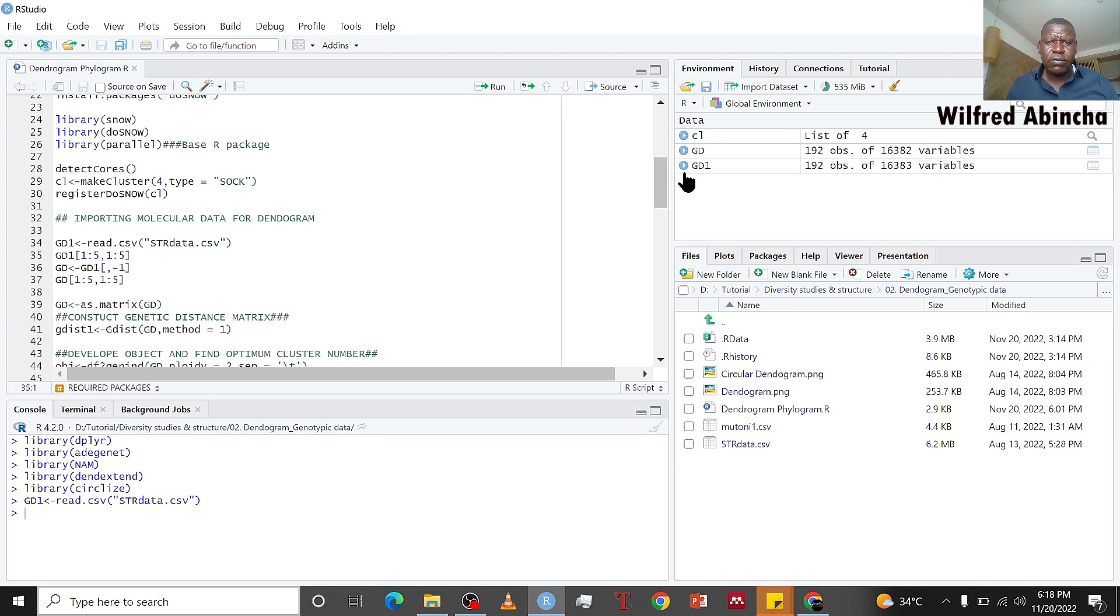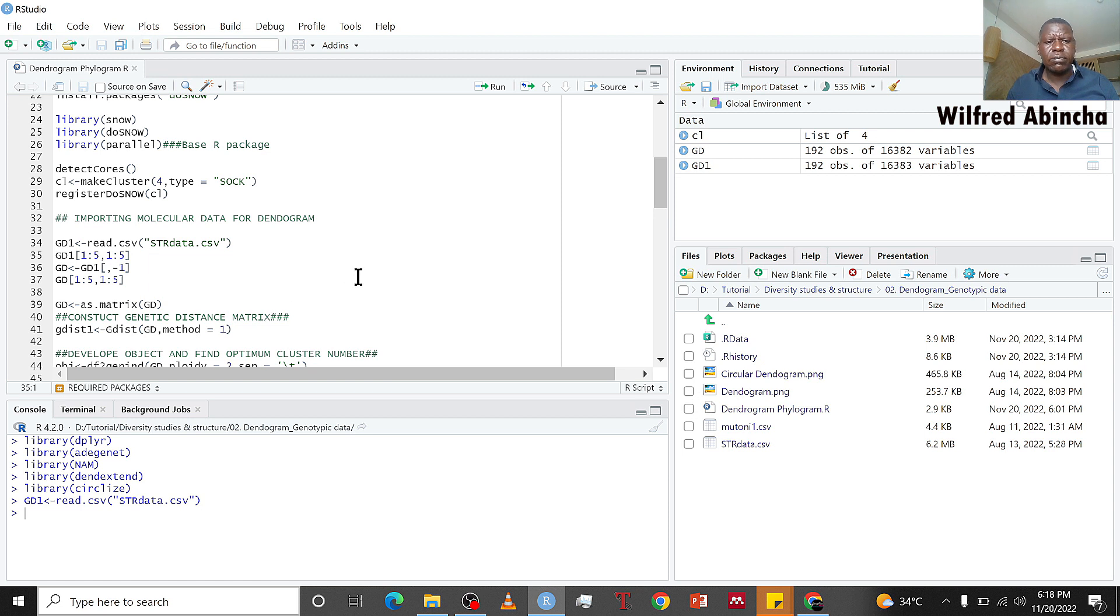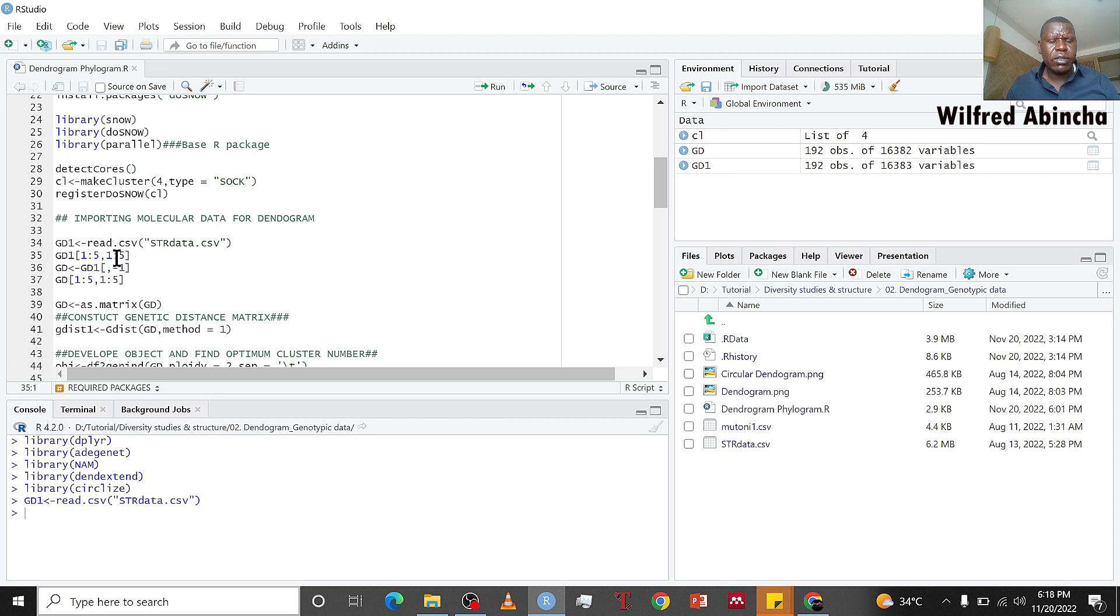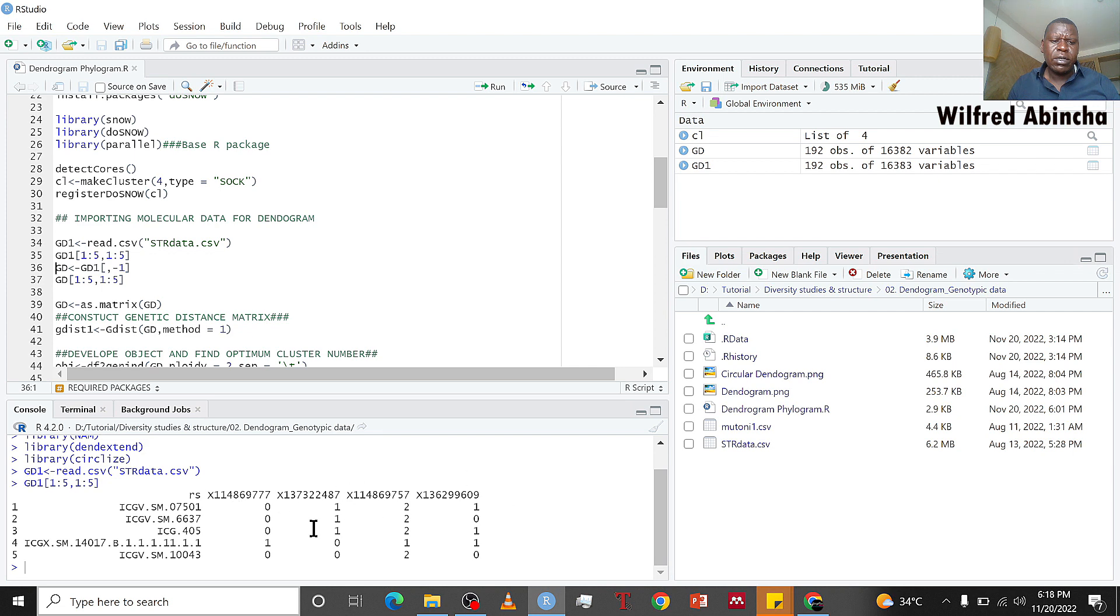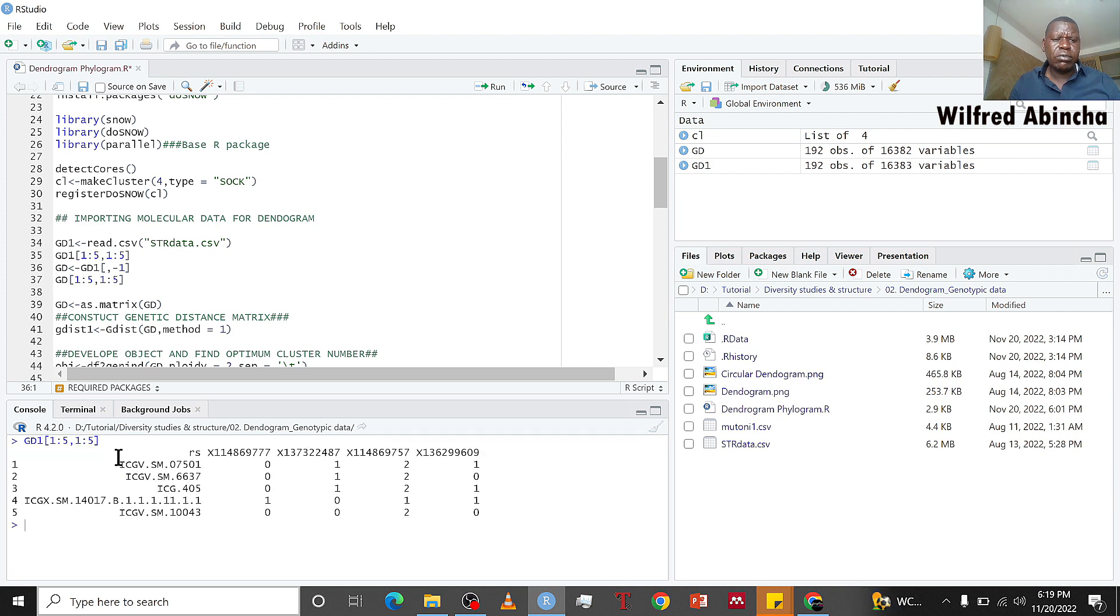Because this data is large, we cannot view it because it's going to take some time. I want to view the first five rows and first five columns so you can see how it is structured. Across the columns these are SNPs and down the rows these are individuals.